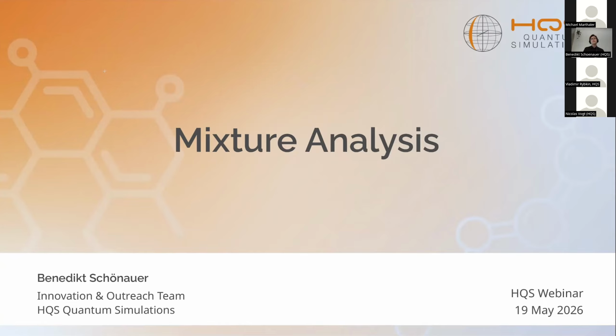So instead of doing this manual integration, we're modeling the mixture spectrum as a combination of component spectra. And these component spectra are calculated from accurate NMR Hamiltonian representations of the components.